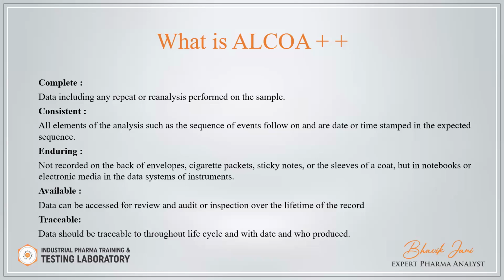Data should be available within 5 minutes. So you have to manage your system like that. If for searching of the data your organization takes 20, 30 minutes, then it's not available. So you have to manage the system like that. It should be available within 5 minutes.